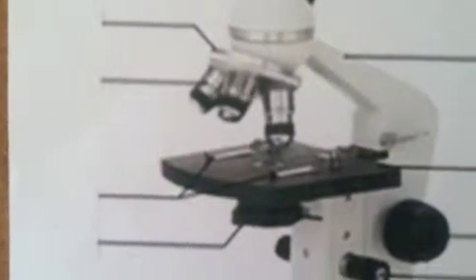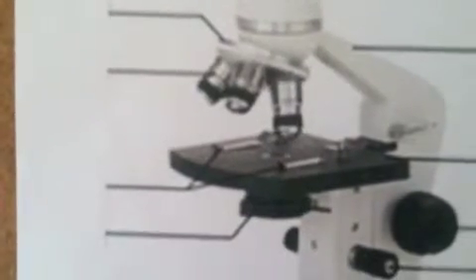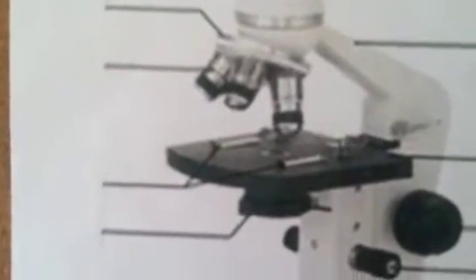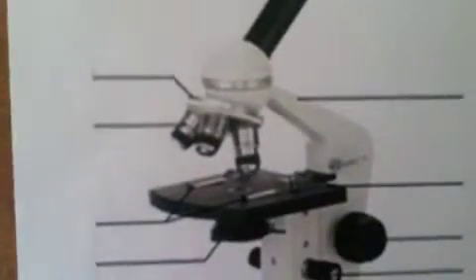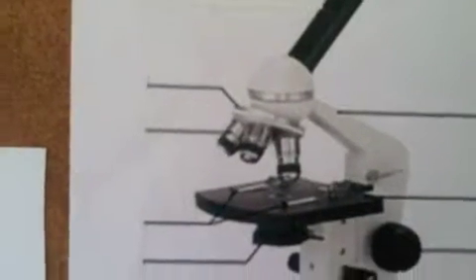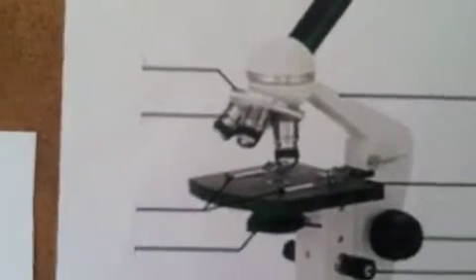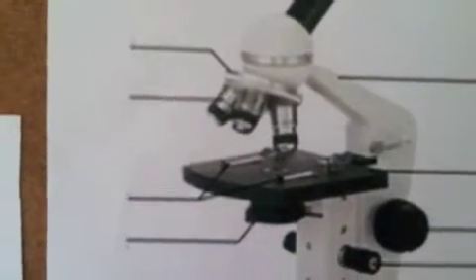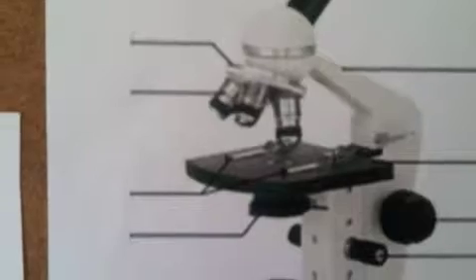In order to calculate the total magnification, it's the ocular power times the objective power, and the ocular power in this microscope is ten times. So for the scanning power, it would be ten times four, so the total magnification of the scanning power objective lens would be forty times.